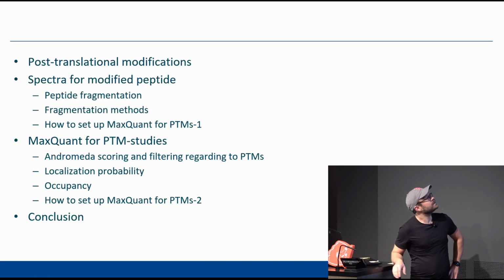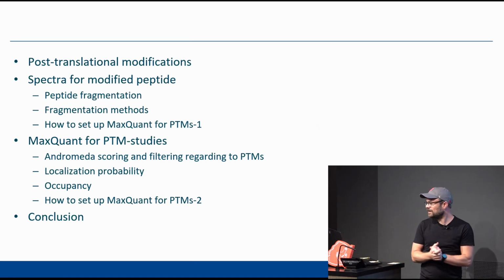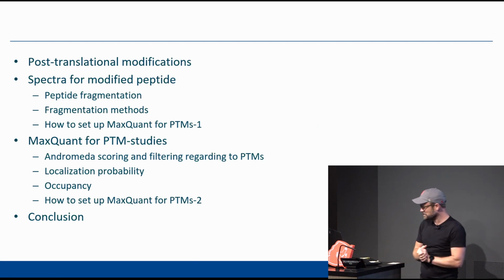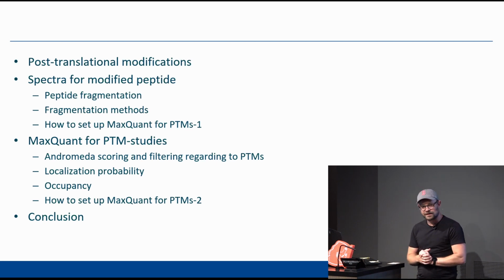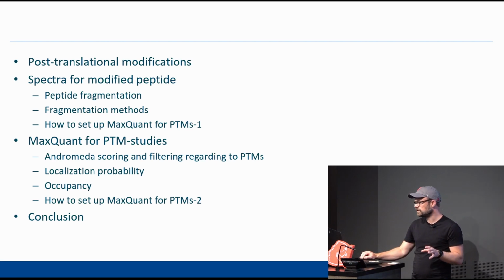First, I will explain what post-translational modifications are. I'm a physicist by training, but let's see how that works. Then we come to the spectra of modified peptides. We talk about fragmentation methods, how these spectra look, and what settings you have to set in MaxQuant for these PTMs.